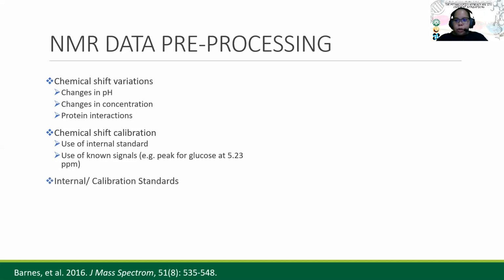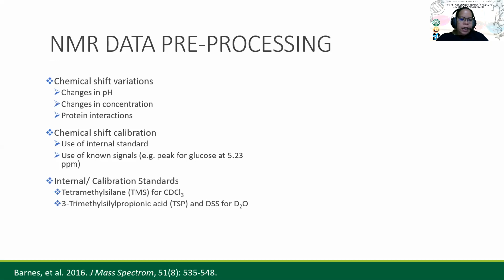The internal standards that are commonly used include tetramethylsilane, for example for deuterated chloroform. You also have trimethylsilylpropionic acid (TSP) and DSS for deuterium oxide.